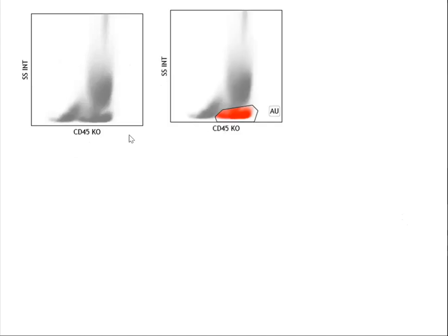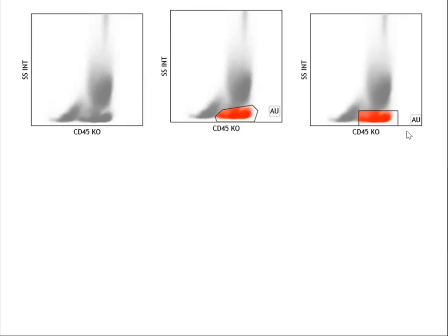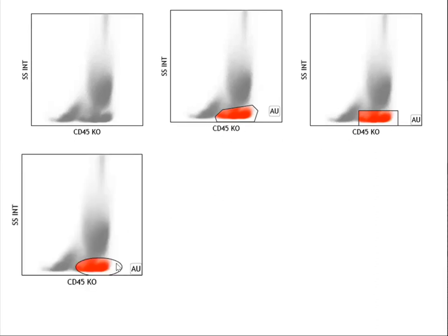Now this is a side scatter CD45 plot. Now how does a polygonal gate look like? This is a polygonal gate, where I manually draw a region around this particular population of interest. Now how does a rectangle gate look? This is how a rectangle gate looks, which I don't commonly use because populations are not that well shaped and well defined. Rectangle is something that by default comes only as a rectangle. During live analysis, you let me know, I'll show you everything. Then this is an elliptical gate where you select the population with an elliptical region.